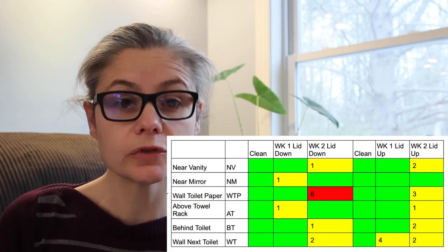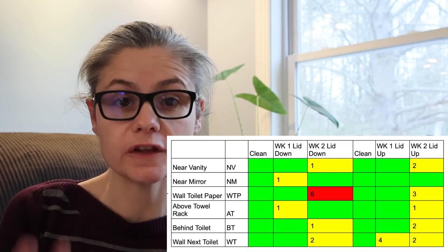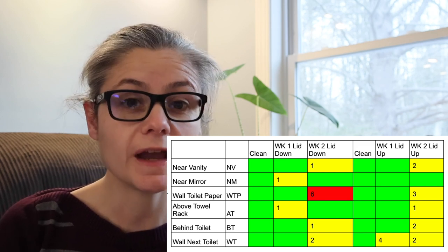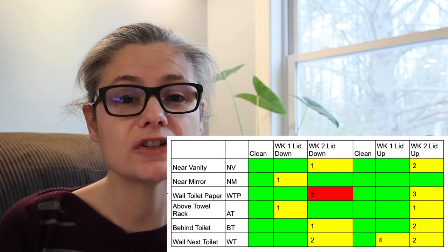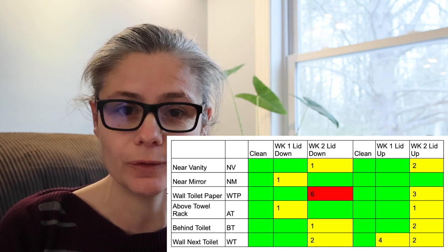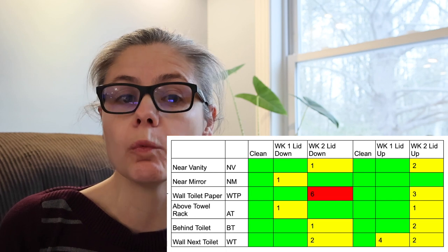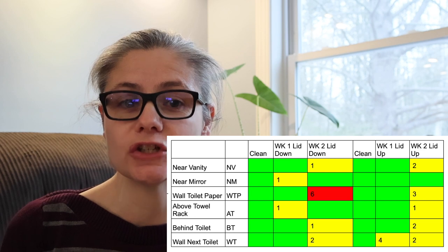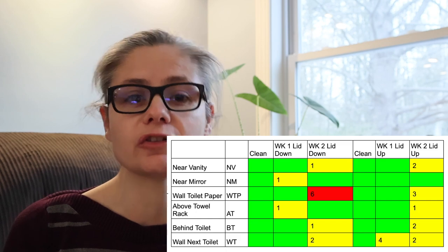I made a chart so we can look at all of the results together. What was really good is after cleaning, all of the samples had no bacterial growth. So that's a really good thing. So we know that we were starting fresh with nothing on the walls. The area in which we had the most bacterial growth was the wall that the toilet paper is on, week two of flushing with the lid down. But we did see in week two of flushing with the lid up, all but one of the areas had bacterial growth. In looking at these results, I do not see a huge difference among the bacterial growth between flushing with the lid up and flushing with the lid down.